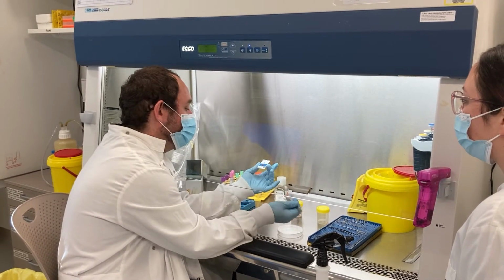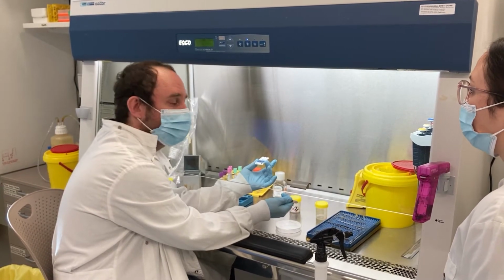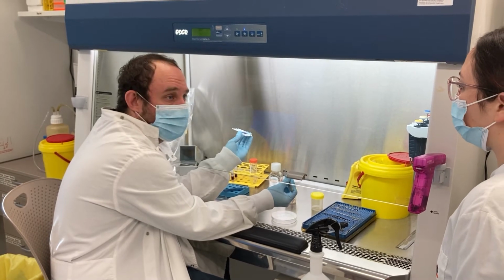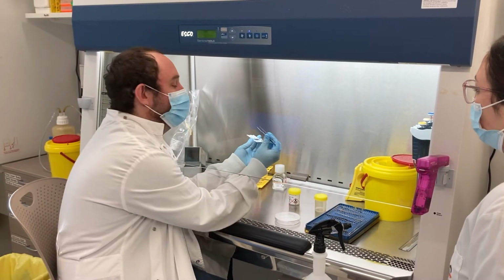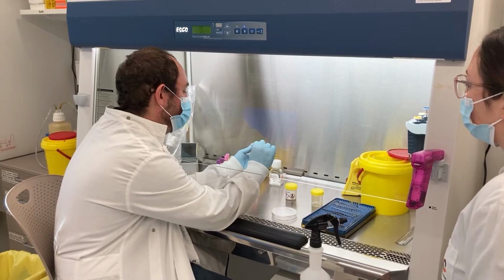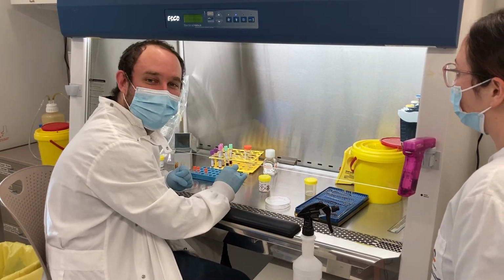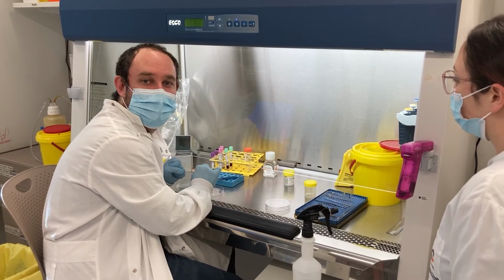In fact, we've just started making a new model to look at immunotherapy response based on this kind of model with tissue slices. We think it's a very replicative model to look at the microenvironment of the tumour. This is just to look at the way the tumour is inside as well. So this will get embedded in paraffin, sectioned up and sliced, and we'll have a look histologically at what it is. So all we do is fix it, into formalin overnight. With the patient we received about an hour ago as well, we had 2 today. We'll leave this overnight, and the next day take it up to histology and get it paraffin embedded.